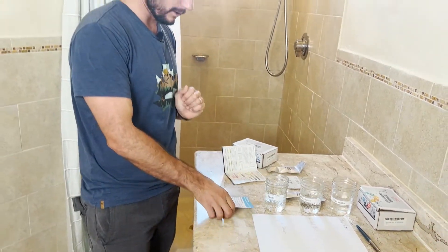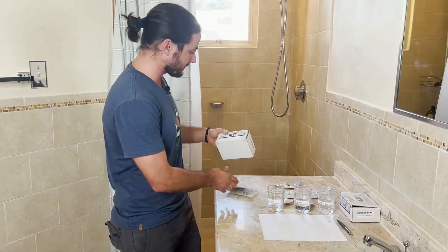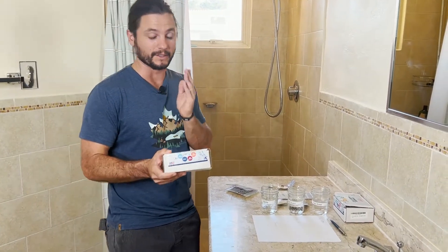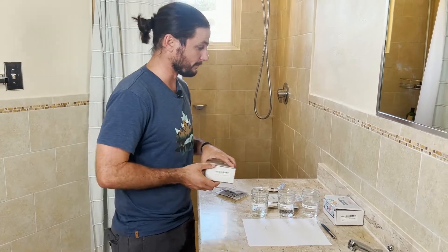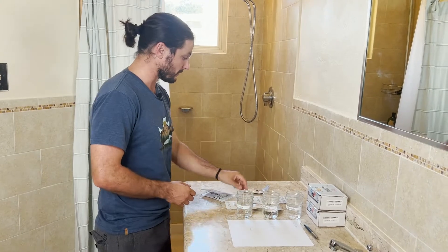So without any further ado, we can get into this. I bought this — it's made in the USA. There are a lot of faulty test kits out there. I got this on Amazon; it seemed pretty credible, like a legit brand. So we'll see how this test goes.